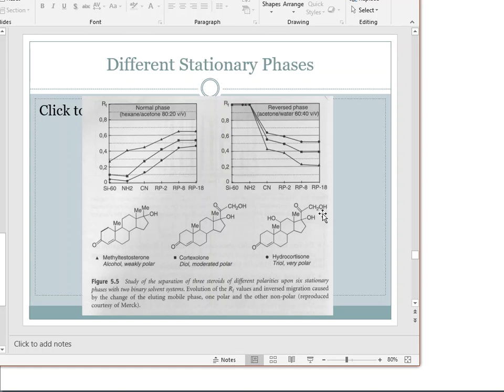But this one's got it as well. So out of the three compounds that I'm looking at, this one's the most nonpolar. Then this one increases the polarity a little bit because it's entering in this double bond O up here at the very top that my first one did not have. And then in the third one, well, this piece is identical to the middle. The difference here is that this is added on an OH group off to the side, which means that this is more polar than the middle one. So hydrocortisone is going to be the compound out of the three that's the most polar.